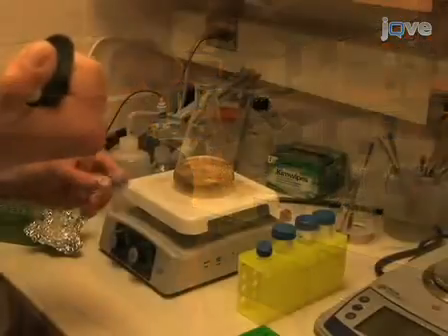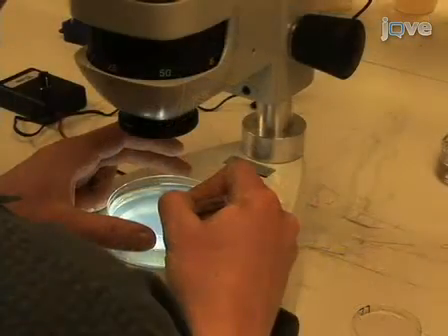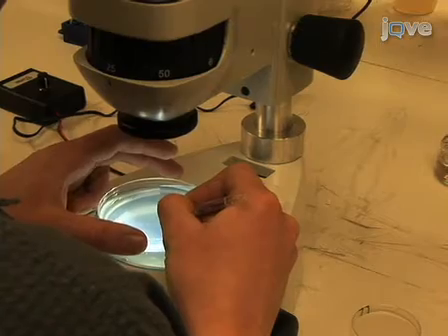I'm George Setfen from the laboratory of Matt Kaberlein in the Department of Pathology at the University of Washington. Today, we're going to show you how to measure lifespan in C. elegans. We use this procedure in our laboratory to study the genetics of aging. So let's get started.